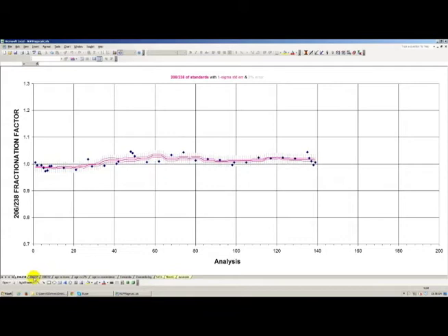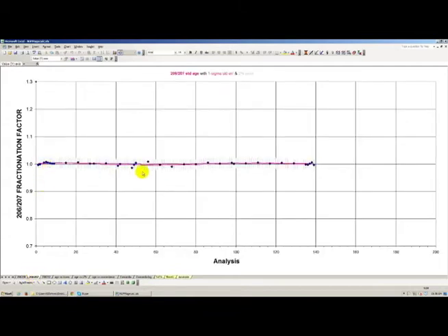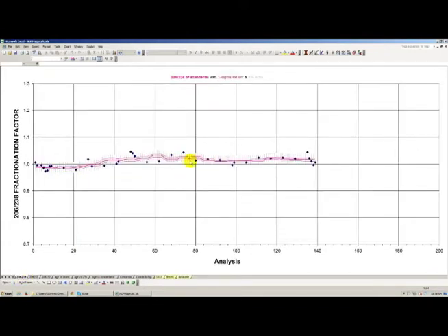Okay, let's look at the 206, 207. So those 2 at the beginning that were off are not in there anymore. And then this one looks marginal, but on the 6-8 ratio, it doesn't look as clear as an outlier as the others were. So we're going to leave it in there for the time being.